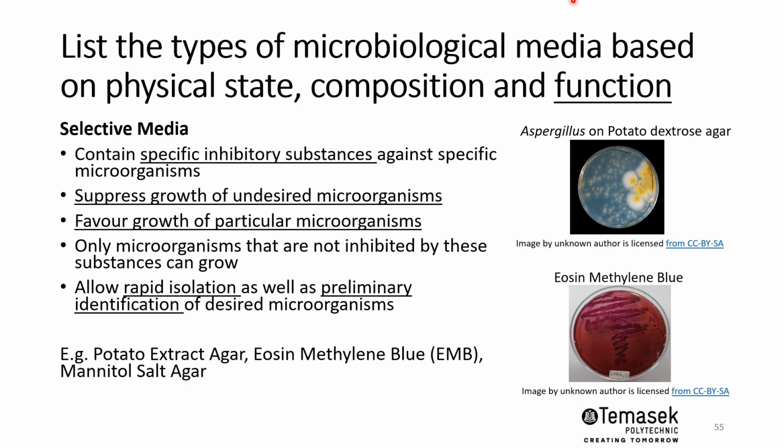Typically fecal bacteria, gram-negative bacteria, ferment lactose, and these are bacteria found in our intestine. Upon fermentation of the lactose, which you may include in the agar itself, they produce acid. In acidic conditions, a pH indicator changes, which allows the colonies to produce a complex color of purple and metallic green.